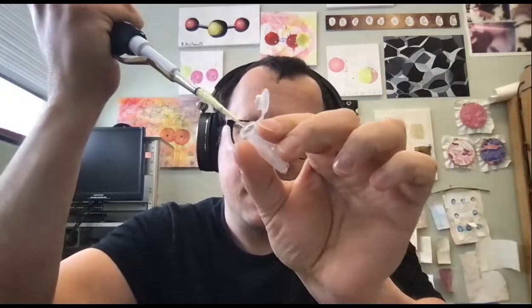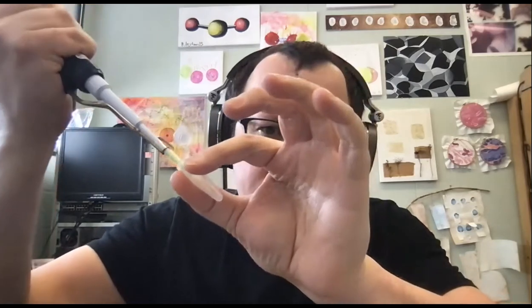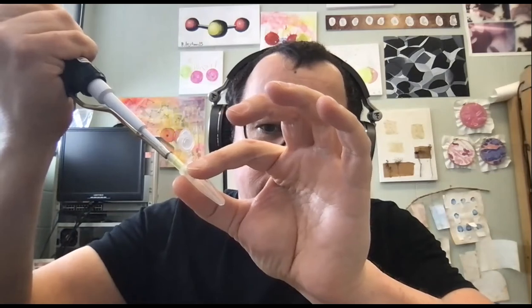Then we get our other tube that we're going to go into, and go down into that tube. We watch what we're doing here. We don't just pipette around somewhere. We're watching where the tip is. We put that down into the bottom of the microcentrifuge tube, and then we push out the liquid. Then you can push further, and that extra step beyond the resistance point pushes a little bit of air out of the tip so that you're getting all of your liquid down in there. If you can see down in there, there's a little bit of liquid at the bottom of the tube.